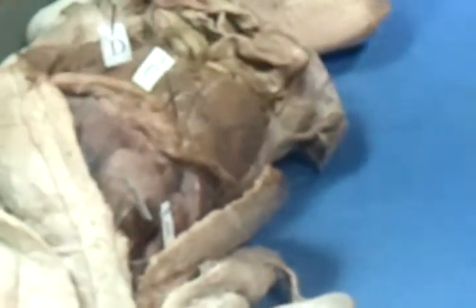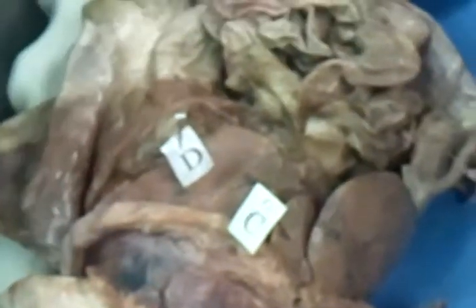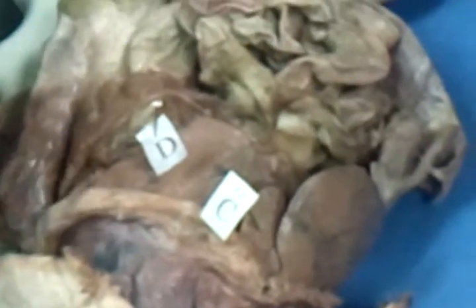Okay. C, what is that lobe? Quadrate. Okay. So the way you can tell is the gallbladder sits right in there, right by the quadrate. So if that's the quadrate, which is the middle, what's this one? Left medial. And then which one is that? Left lateral. Right. So that's D. Now the other ones, which one would this be? Right medial. All right. It's kind of weird how it works, but I picked one that was good.